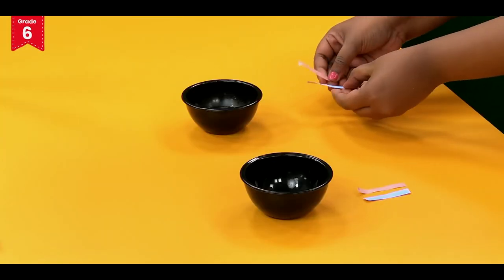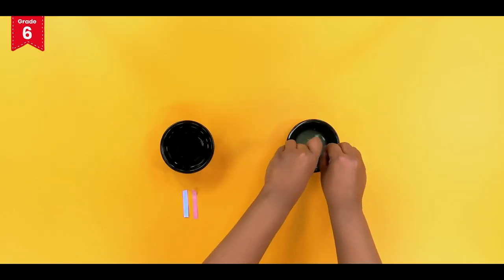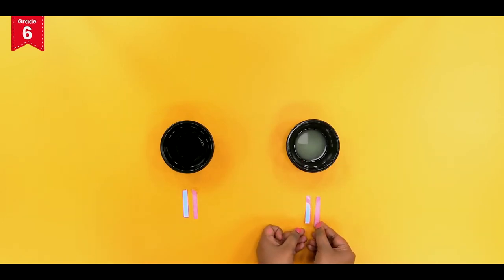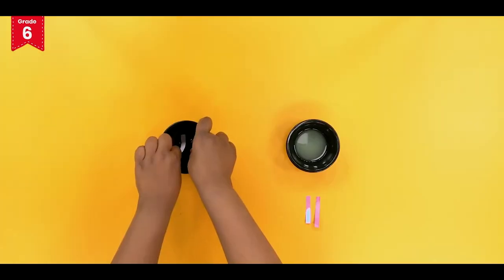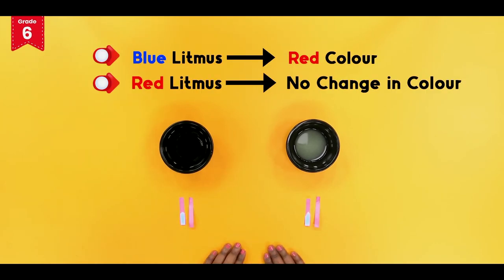First we will dip the litmus strips in the bowl containing lemon juice. Keep it aside. Repeat the same for the bowl containing vinegar. Lemon juice and vinegar change the color of blue litmus to red, but there is no color change in red litmus.